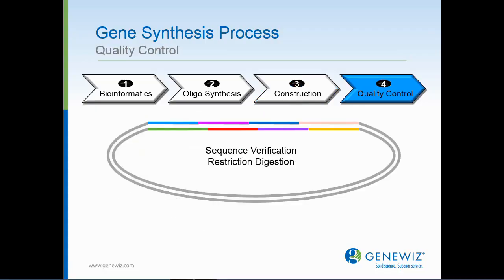Once the clone has been generated, QC testing, such as restriction enzyme digestion, as well as sequencing, is done to ensure that the synthetic gene is identical to the starting reference sequence as per the project design. This clone now correlates to the generation of a nucleic acid construct that consists of all the desired properties or changes one wishes to confer on the specific protein of interest. Simple, right?